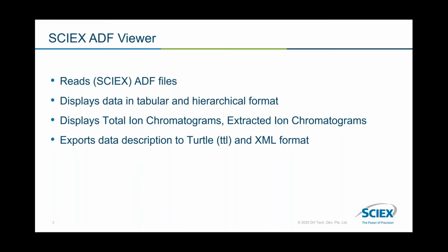It displays data in both tabular and hierarchical format. The tabular data has been flattened to correspond with the way that the Analyst software displays data. We also have a hierarchical view, essentially a tree view, where one can drill into the hierarchy and look at any information there.